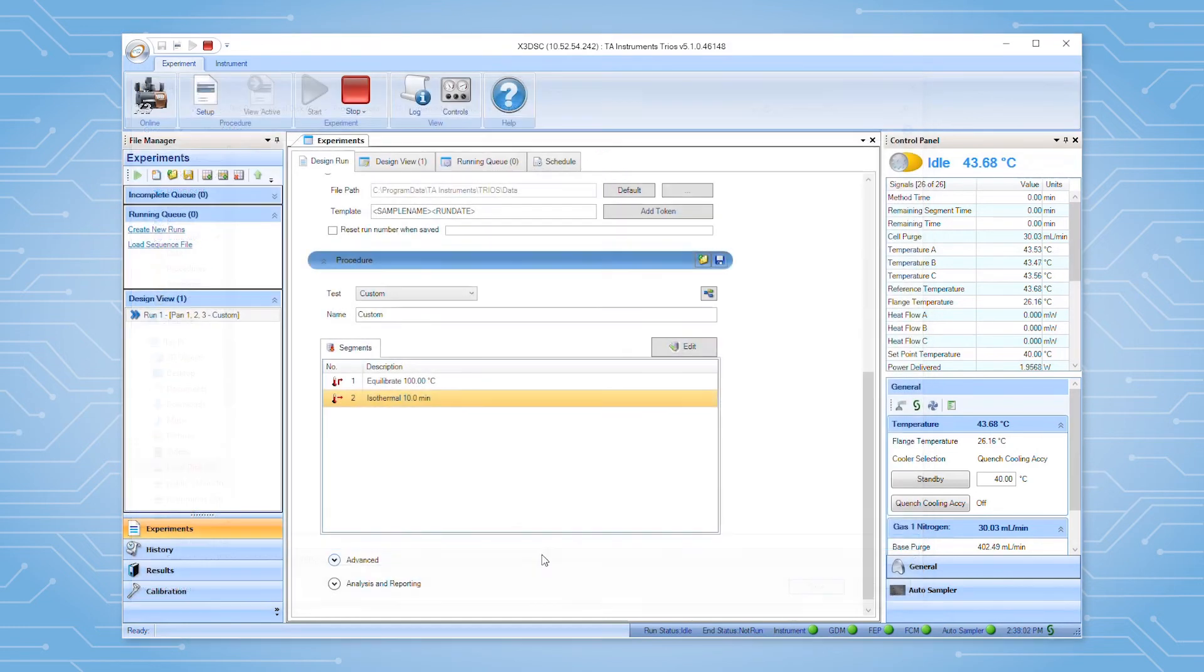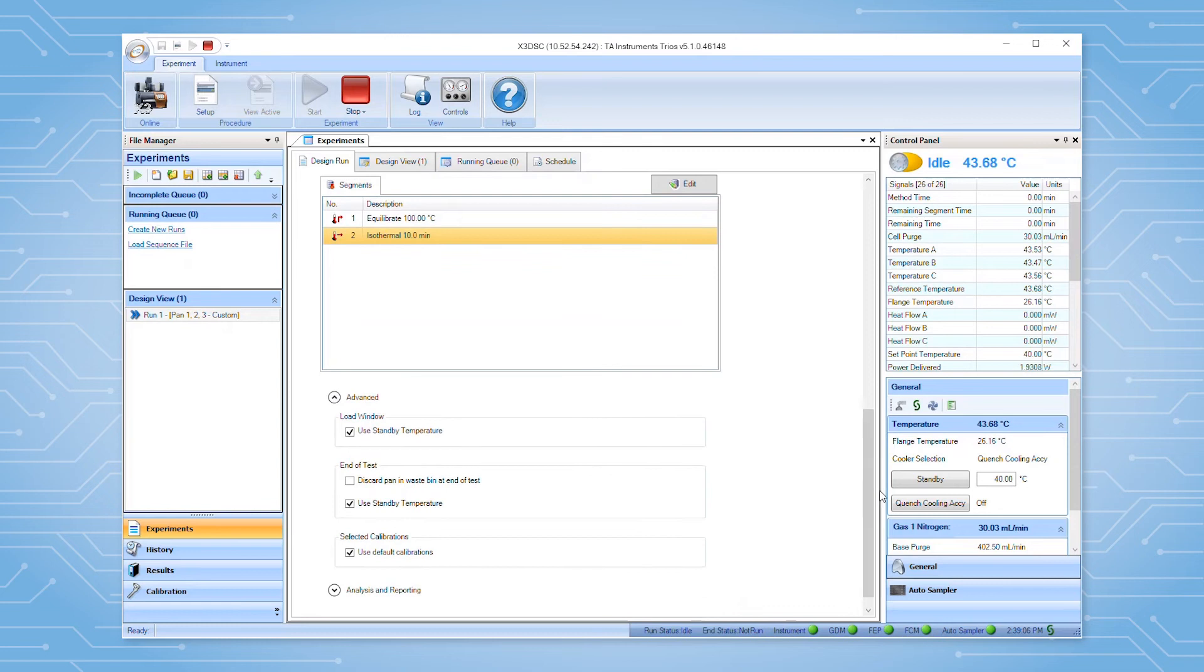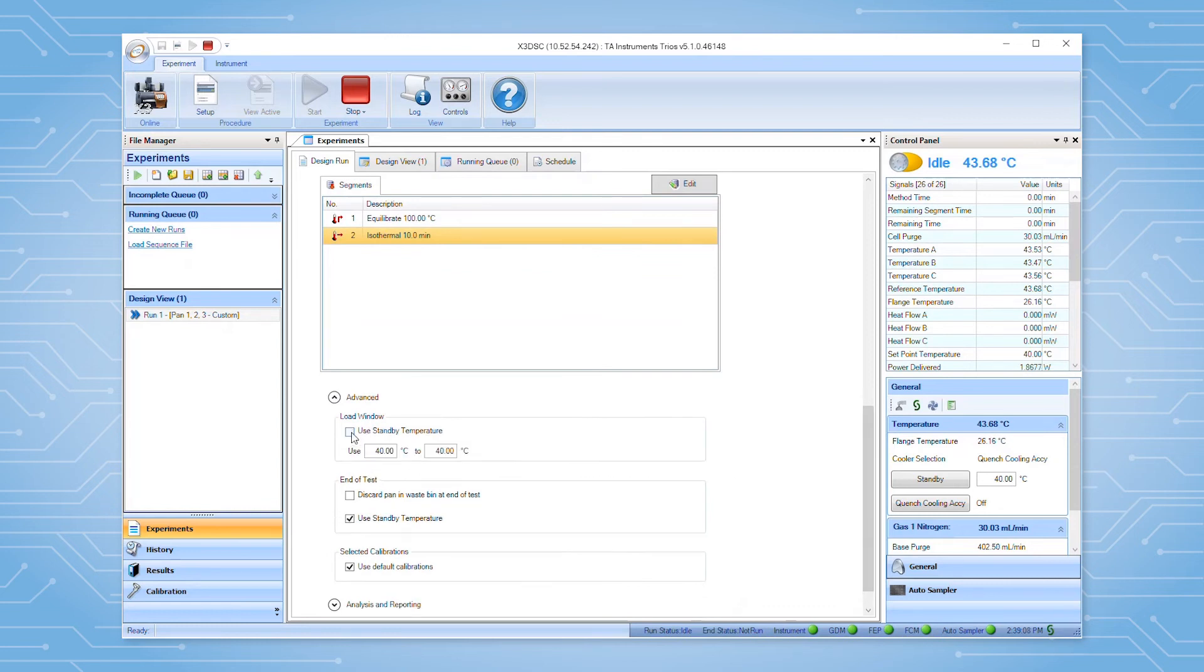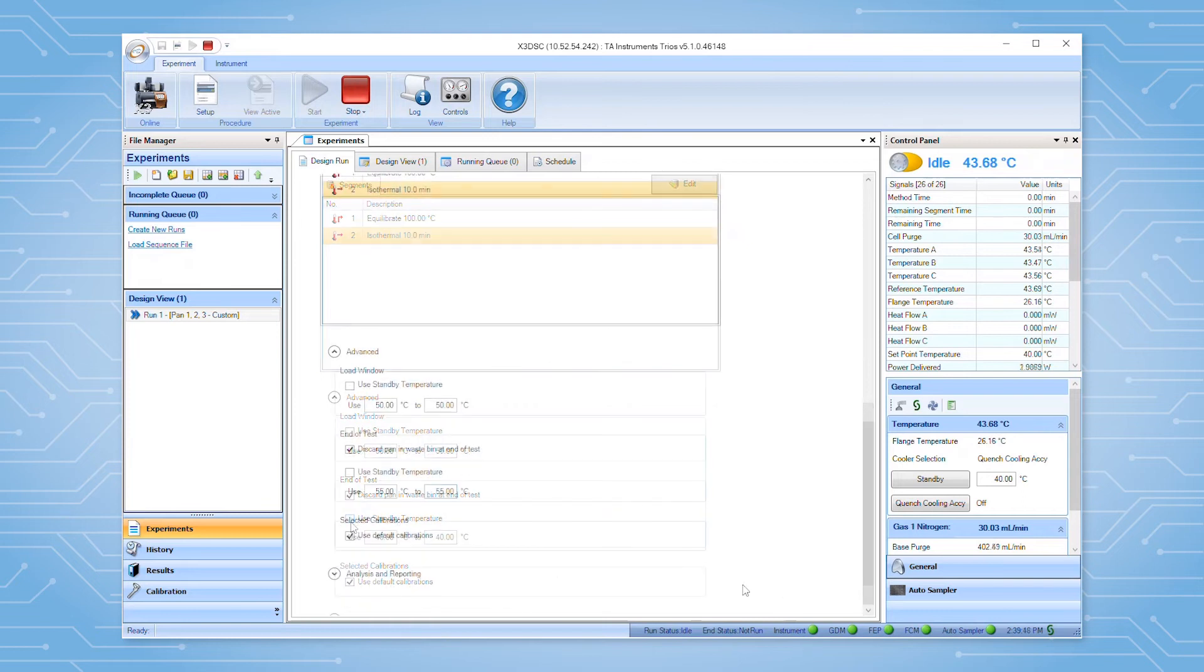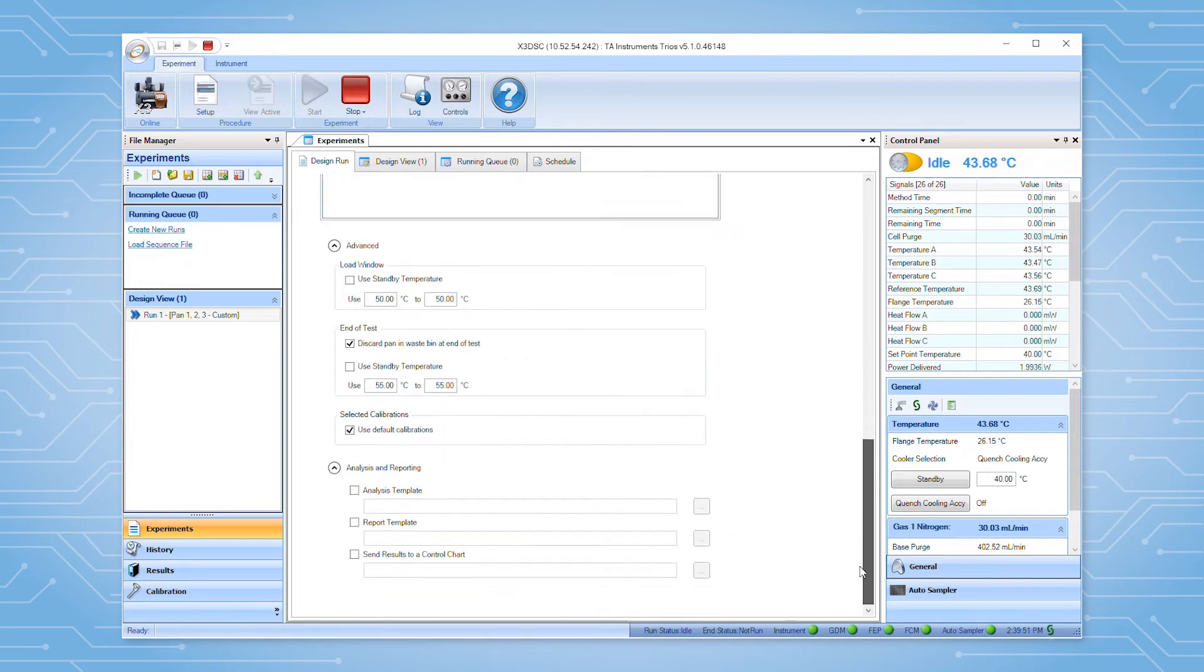The advanced options allow you to edit the temperature range at which the sample pans will be loaded at the start of a test, the temperature at which to end the test, whether to discard sample pans into the waste bin, and which run-based calibration set to use, if applicable. The analysis and reporting section allows you to apply an analysis template or a report template at the end of a test.